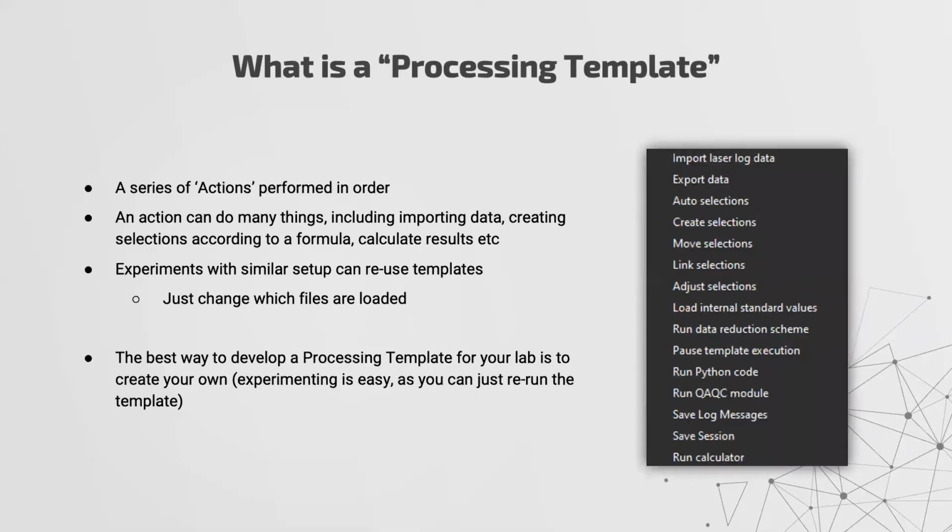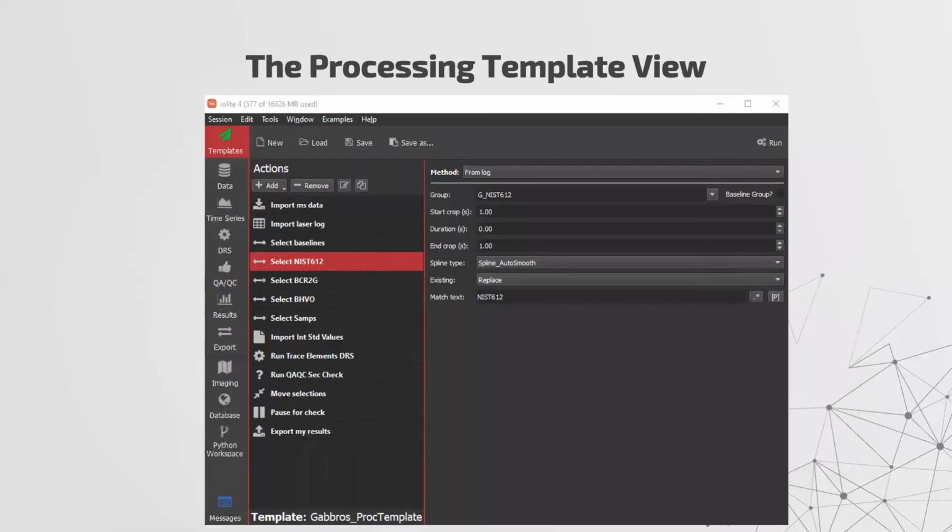And so this is just a list of the current actions that are available. There's a few others that we're thinking about adding, but if there's anything that you think could be an action, feel free to contact us as well. And as I mentioned, probably the ultimate level of automation is to run Python code. We'll only do a quick example of that at the end today.